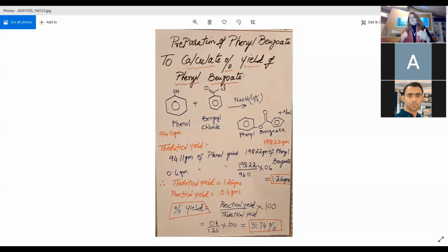Because in recrystallization the question is not only that you need to dissolve. No, you have to recover the precipitate. This is the success of your recrystallization, that you get back your precipitates once they are dissolved in whatever recommended solvent there is. Okay, you dissolved it, right?